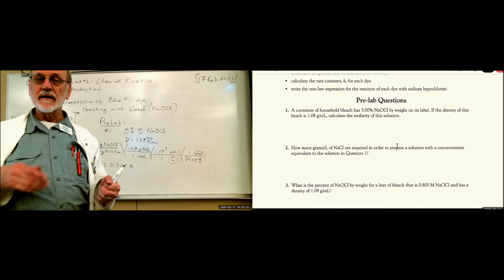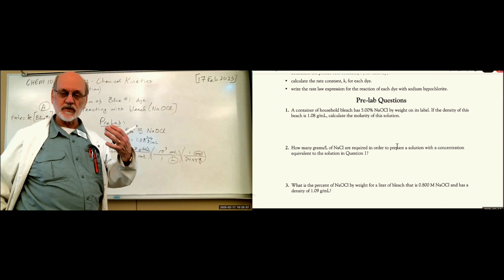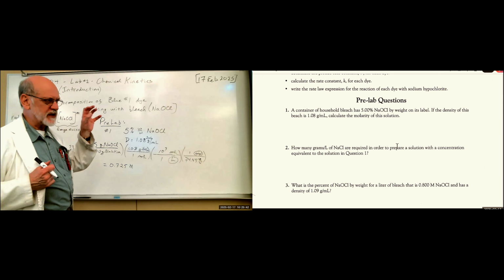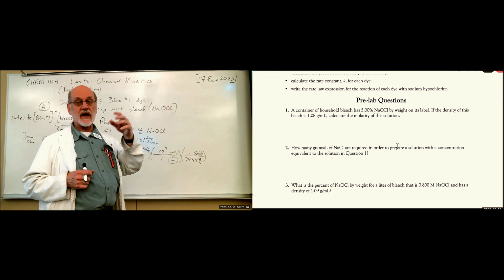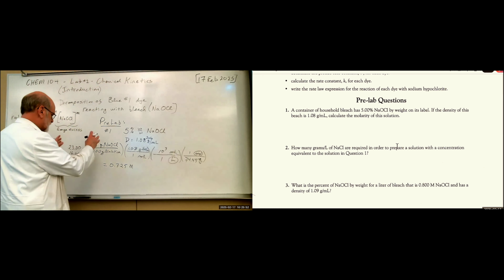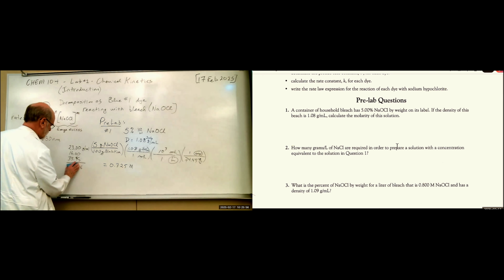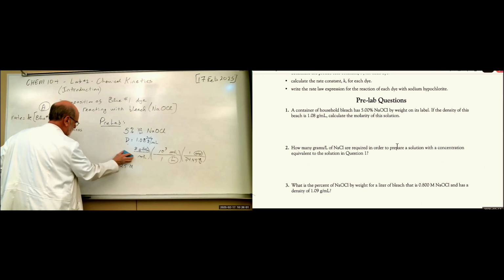And that'll give you the concentrated version, 6% of sodium hypochlorite. Now, when you put sodium hypochlorite into the experiment, you're only going to use a few drops of it. So that requires another calculation, but this is your starting point. Okay, so that's number one. Let's do number two.